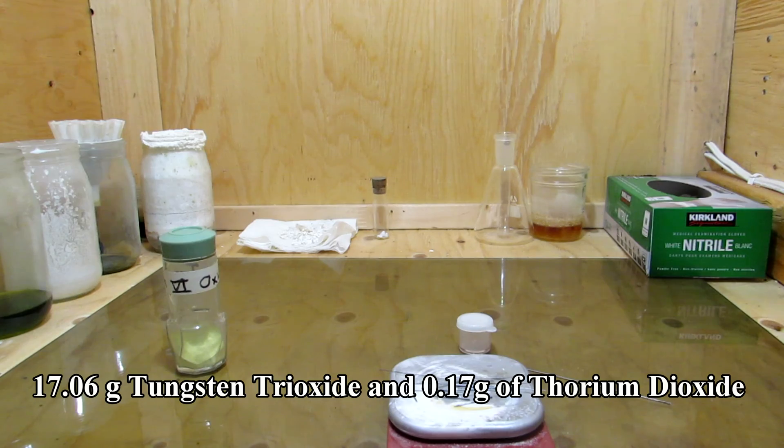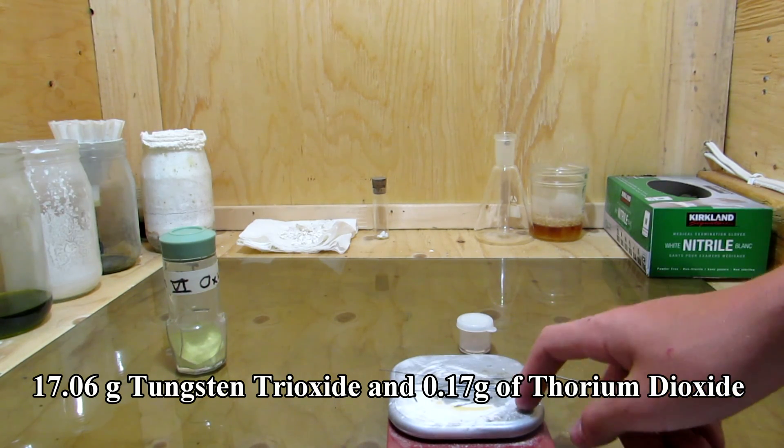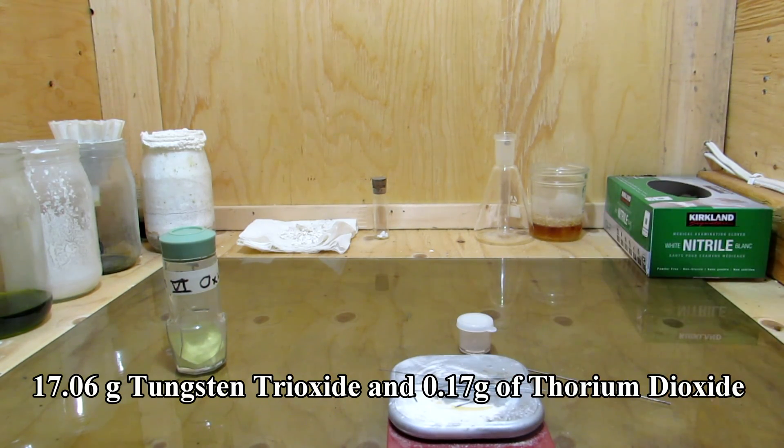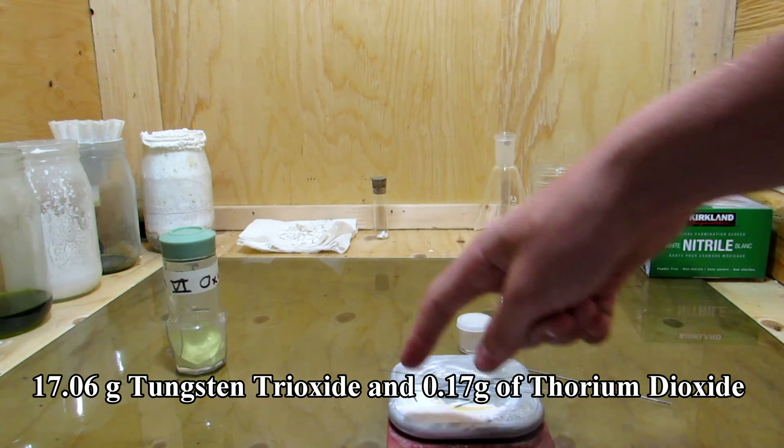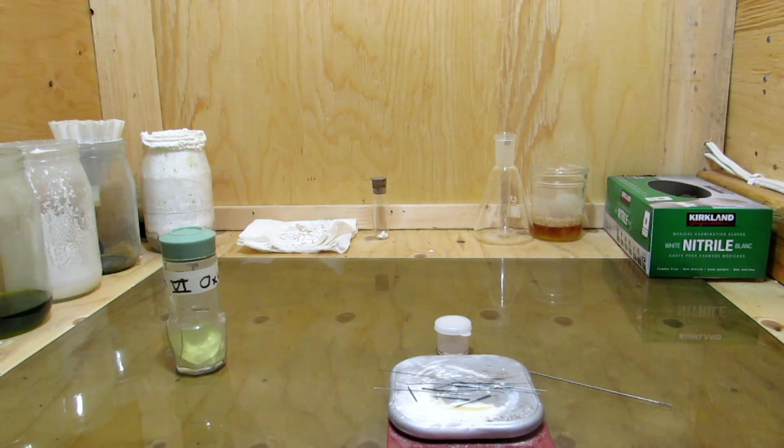However, approximately 2 grams of tungsten didn't dissolve, and some of the thorium dioxide was lost during filtration, so the lower yield was expected. The tungsten trioxide can be saved for a future project where we will attempt to reduce it with carbon in an arc furnace back to tungsten metal.